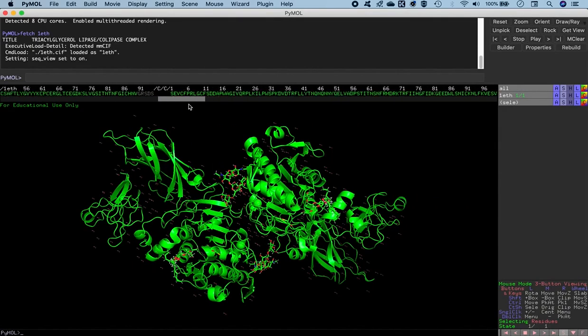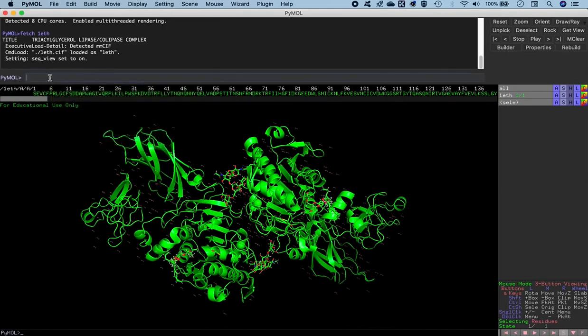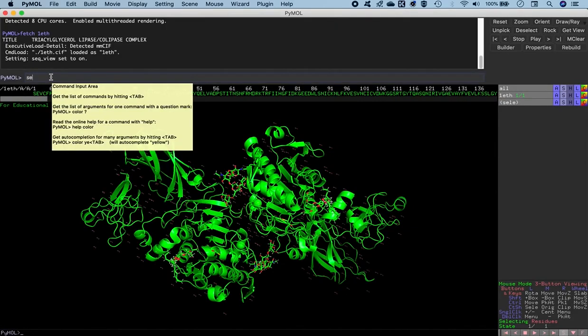So in order to get rid of all the chains, but just retain the colipase, which is the chain of our concern, because this is the fragment that is having all the missing residues here in the N-terminal and the C-terminal, we'll just get rid of all the other chains. We'll remove all the other chains and just retain chain B. So in order to do that, just go to the command line interface of PyMol and do a selection.